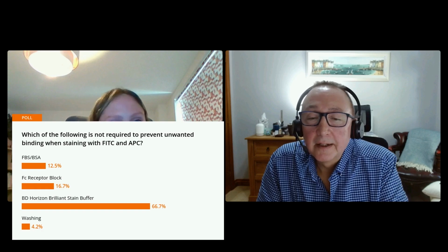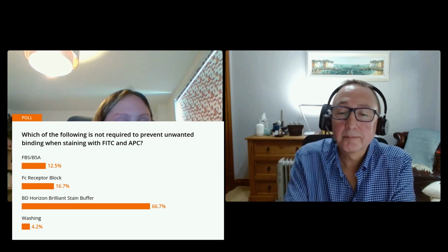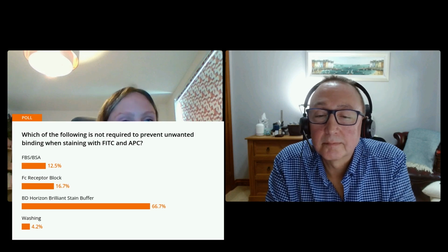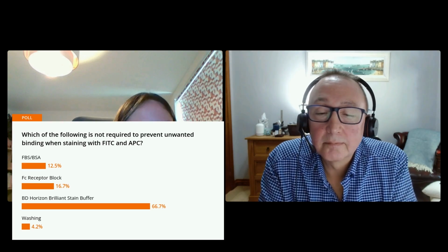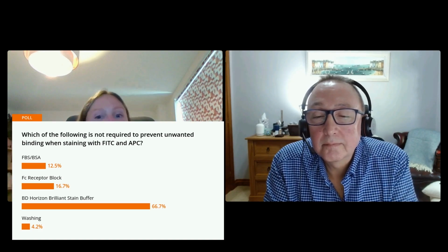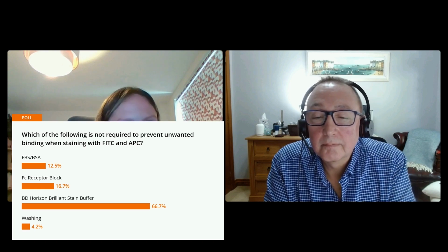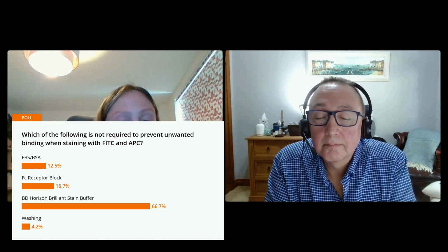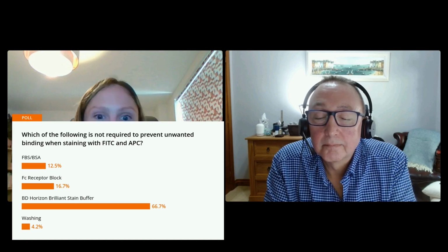So let's have the results of that first poll up. Okay, so Jess, do you want to speak to that? Yep, so we said which of the following is not required to prevent unwanted binding when staining with FITC and APC? And so this can have multiple answers. Actually, no, there's only one answer on this question. Yeah, so those of you who said the stain buffer, you would be correct.